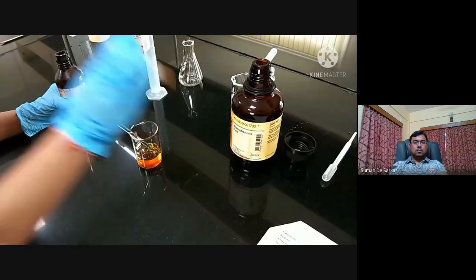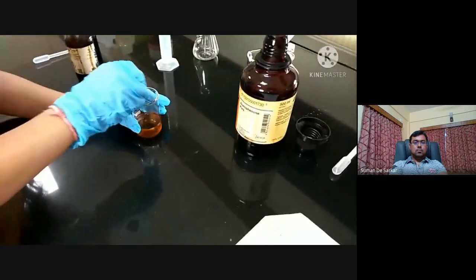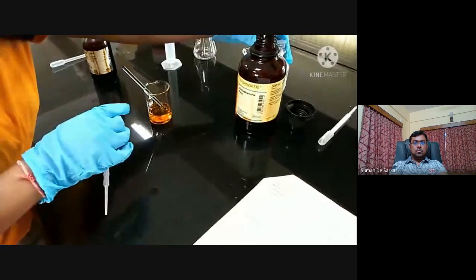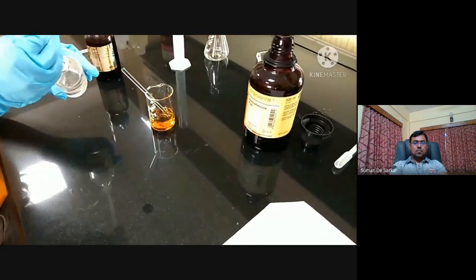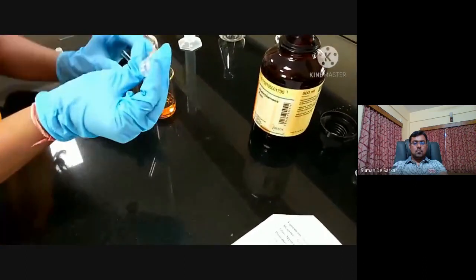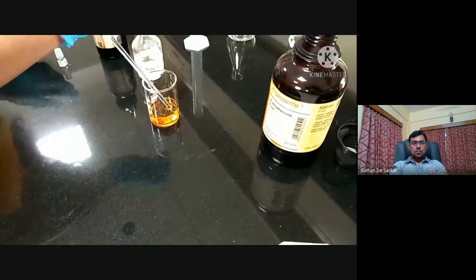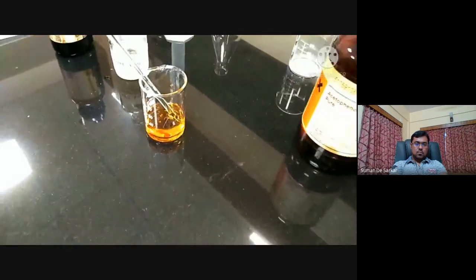After adding these two, all the liquids are now soluble, and we need some catalyst, acetic acid, to promote this reaction as per the instruction. We need only a few drops of acetic acid. The mechanism I already discussed. Adding a few drops of acetic acid. You see, we got a nice yellow color of the reaction mixture, but still no product yet.